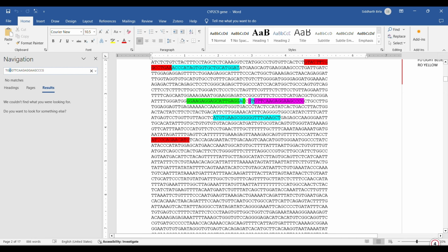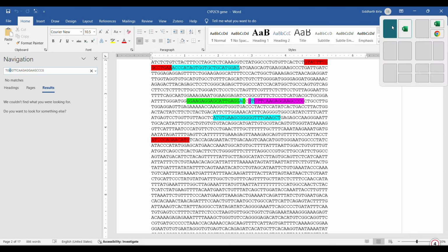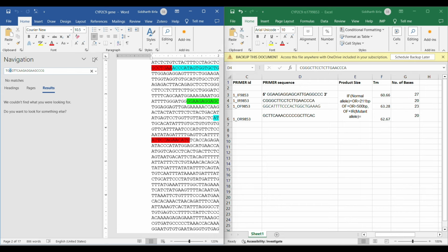So here what we need to do is we just need to make the complement of these and add it to the software that we are checking for specificity, right? So how we'll do it, this is how we'll be doing it.